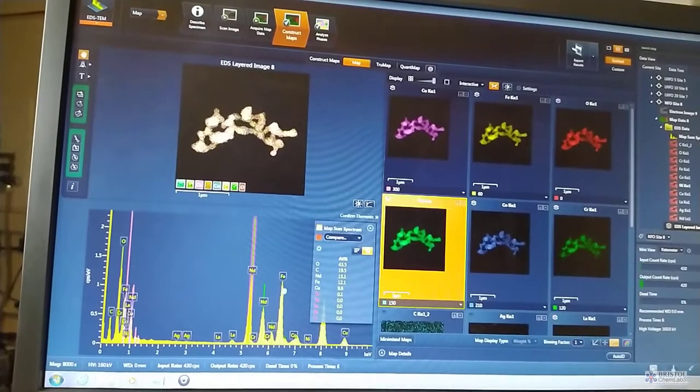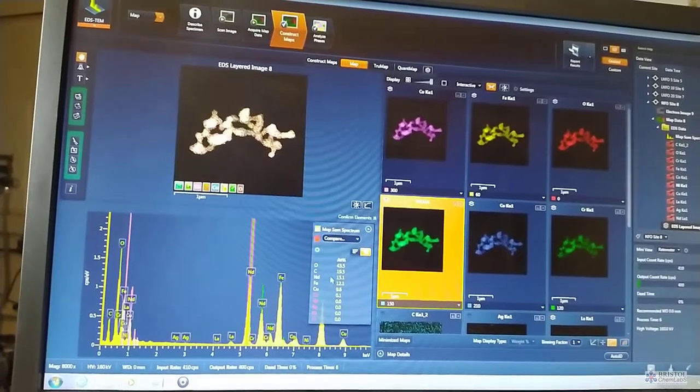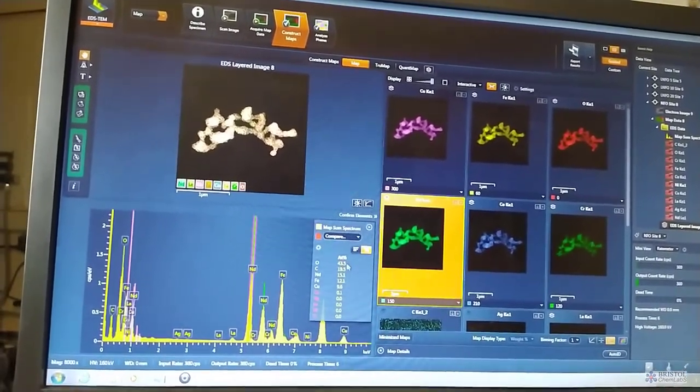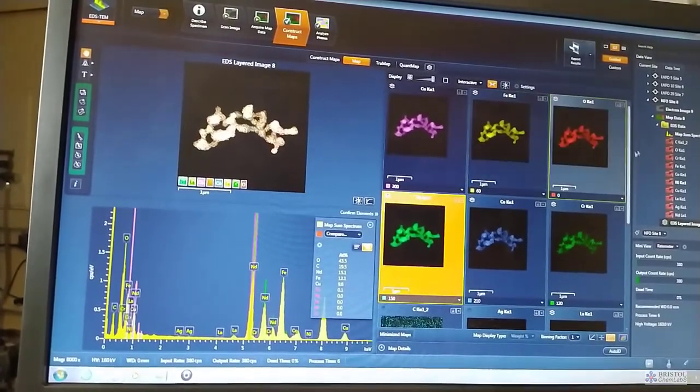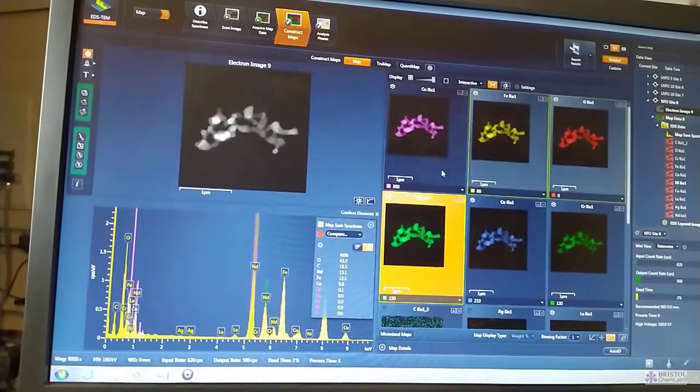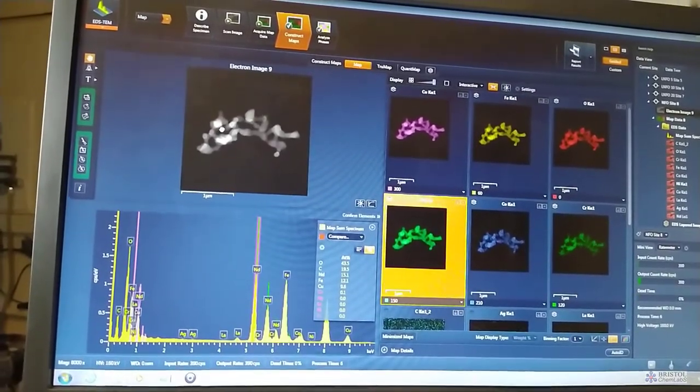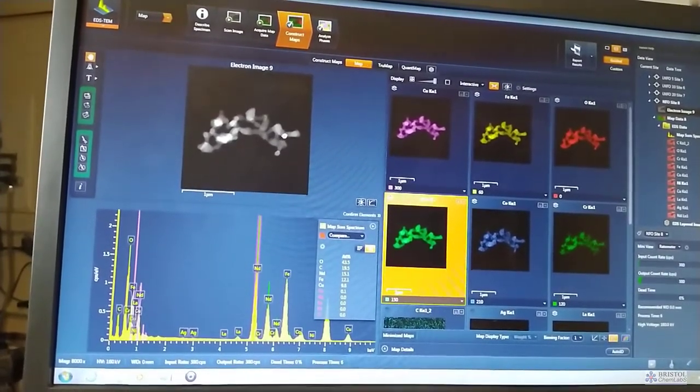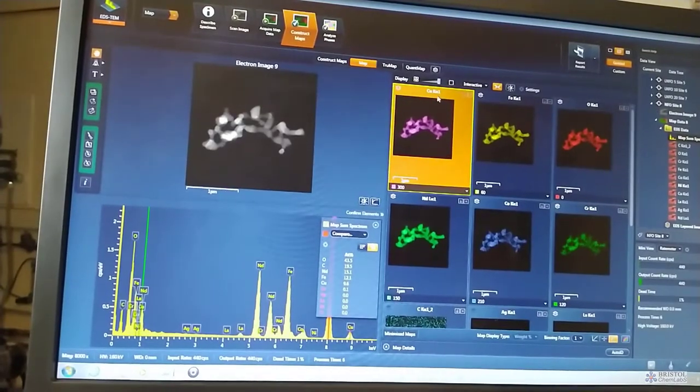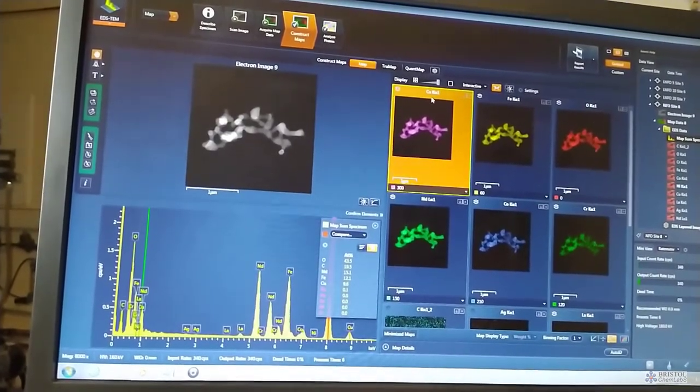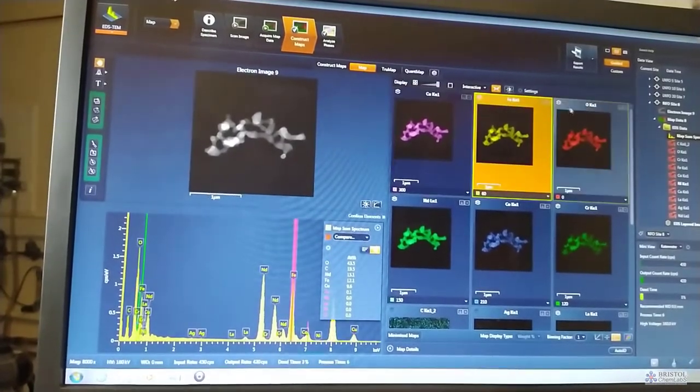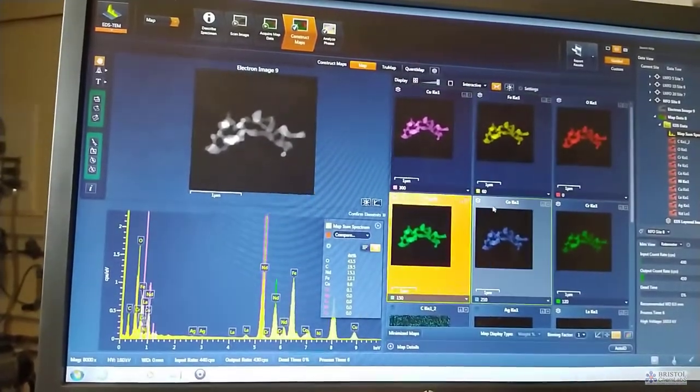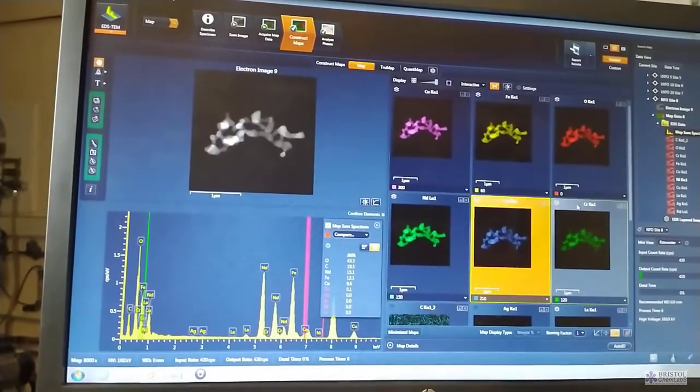So the spectrum showing the different elements present within the material, the relative atomic weight percent of the material. This is the transmission electron micrograph image, and then we can see the distribution of individual elements mapped across the sample: copper, iron, oxygen, neodymium, cobalt, chromium.